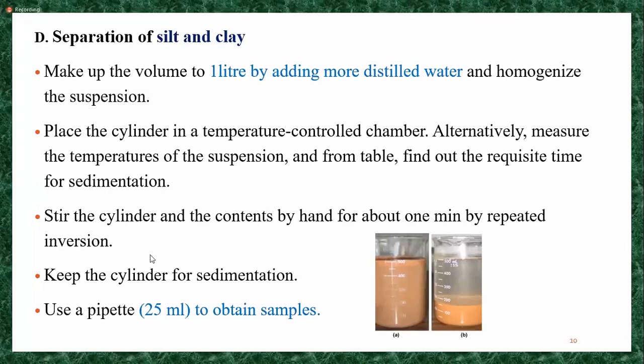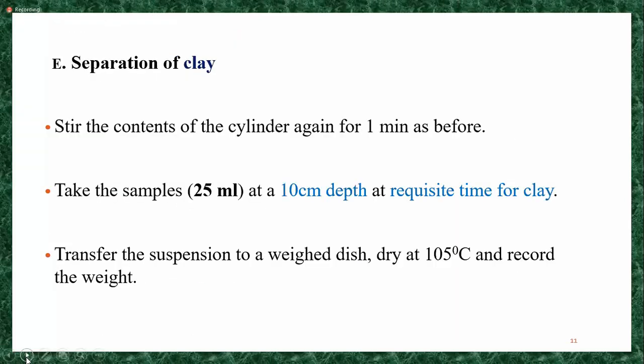After this procedure, you have to pipette out 25 milliliter of sample. I will tell what is the purpose of doing like this. We will move to the next procedure.